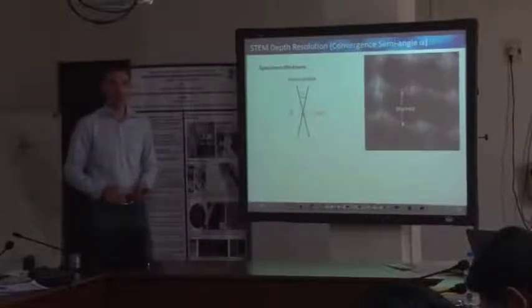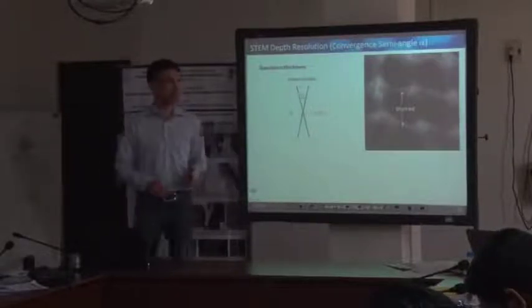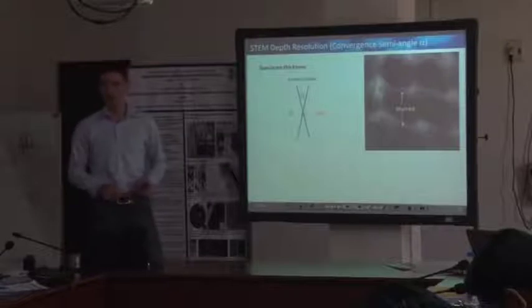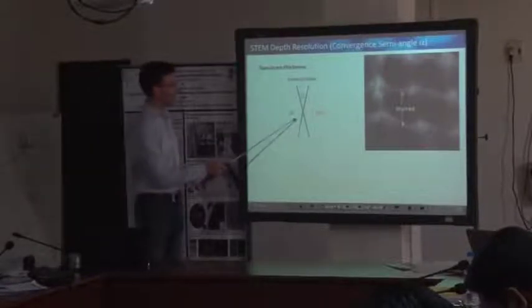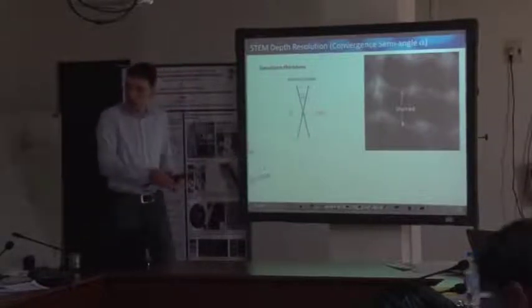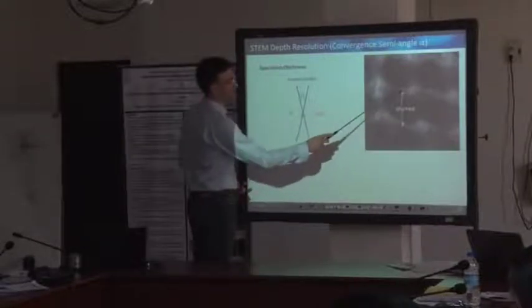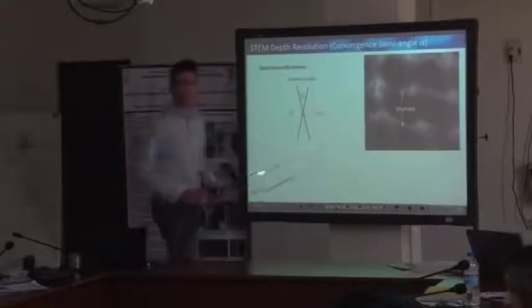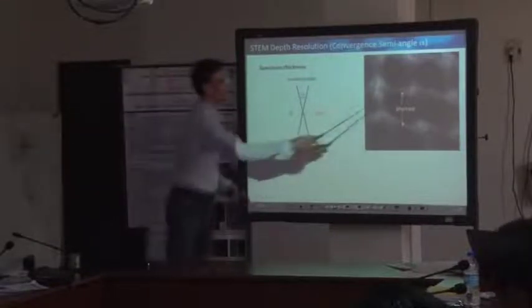Now, for this very, very thick sample, we have to think about our depth of field. Because now the sample is already 3 micrometers, and current TEM investigations are not done at 3 micrometer sample thickness. If you do that study using a regular STEM probe, what you will see is that on the top and on the bottom, some of these marker particles, gold marker particles for the realignment of our tilt series, already get blurred.